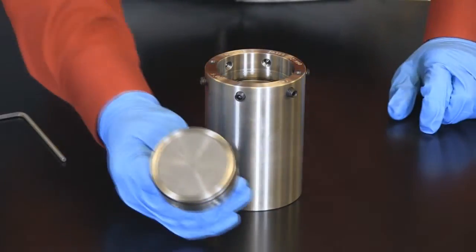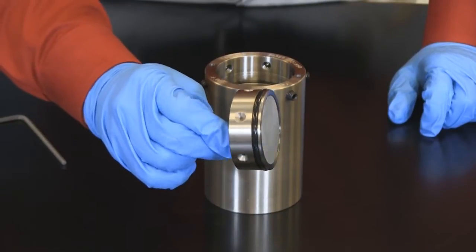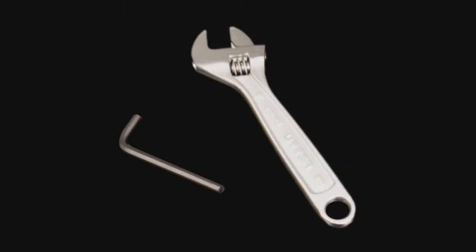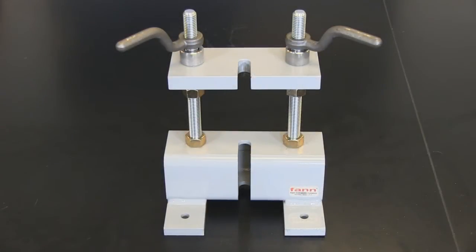Top and bottom cap valve stems are used when applying pressure and to allow filtrate to flow into a receiver. You'll need a hex key wrench and an open-end wrench to use this cell. Many labs use a cell clamp for added safety.